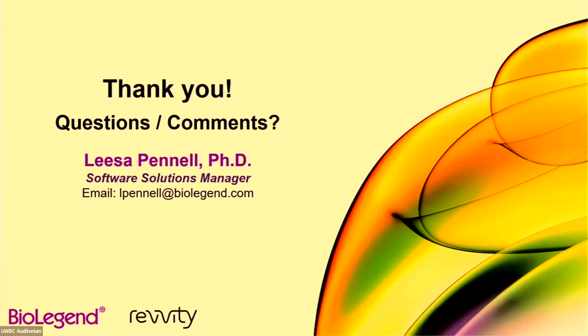I see what you mean. From what I have seen, you still see those little blobs of the doublets, or maybe even more than that. I haven't seen that those get bigger. I feel like they just get spread out over more of them. You'll definitely get more doublets than you would if you're not using them, so that'll definitely change that number of doublets. But I think it's more robust detection than just saying, oh, that seems like there's probably the RNA quantity of 2 cells.